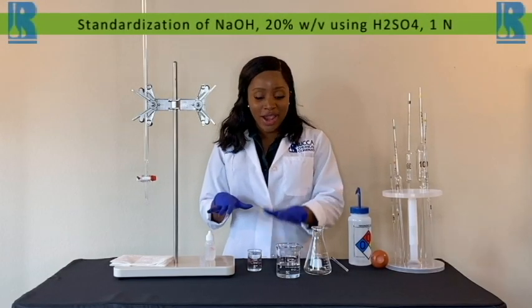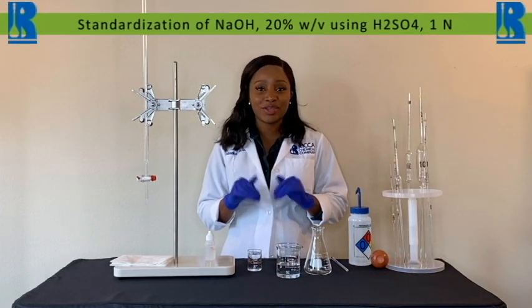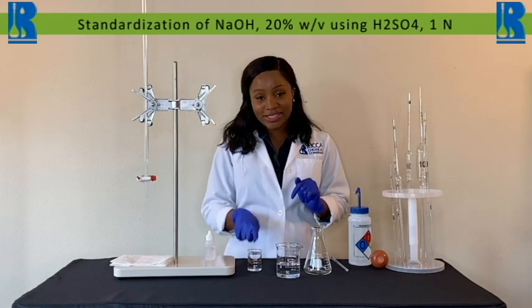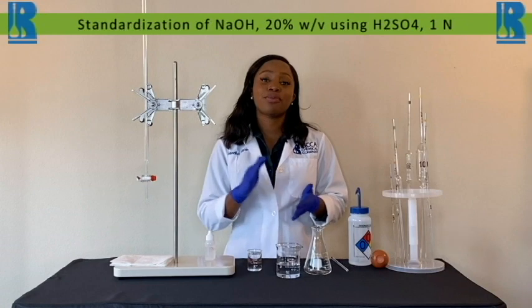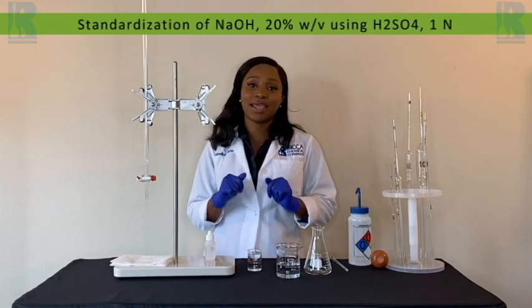Our sample today is a 20 percent sodium hydroxide weight volume. Because percent solutions are not typically used as titrants, but rather as reagents to either adjust pH or to remove interferences, we can actually use a secondary standard, meaning a titrant whose concentration is traceable to a primary standard.